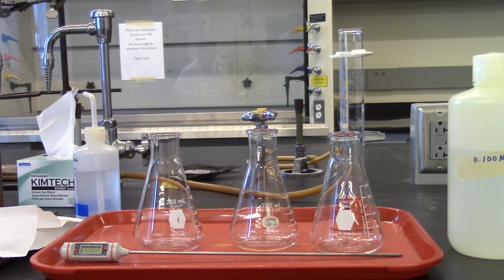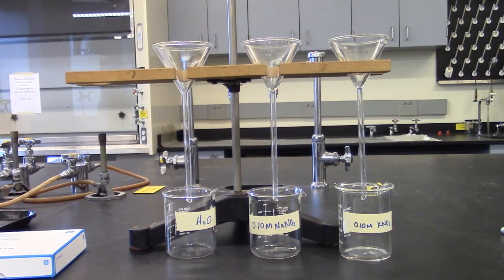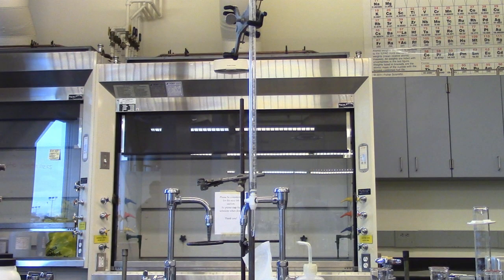For this experiment you will need the following: 100 ml graduated cylinder, three 250 ml Erlenmeyer flasks, and a thermometer. You will need a ring stand, a funnel support, three beakers, three funnels, and you will use a 50 ml burette.